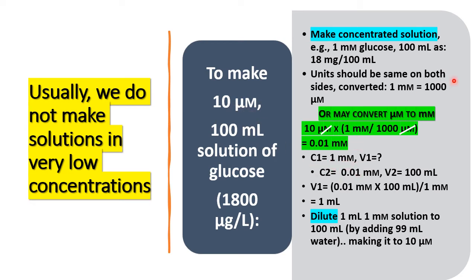So rather than making this conversion, we are making this conversion. Here, whenever you want to make such a calculation, here is the example. 1000 micromolar contains 1 millimolar. These are the same. And you want to find out how many millimolar are in 10 micromolar.